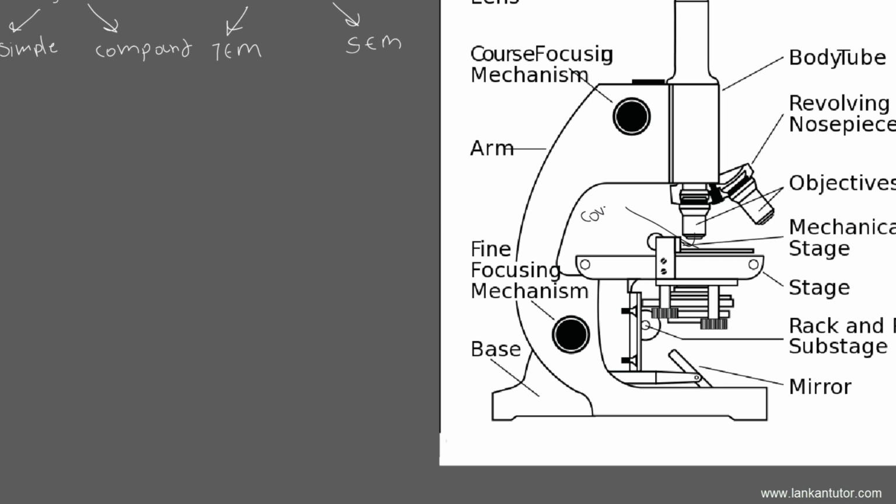The biggest knob is called the coarse adjustment, and it's what you use to get the main focusing. And then there's a little knob called the fine adjustment. The fine adjustment is to get the details and make sure you have the perfect resolution. And a bunch of clips, which are called the stage clips, and they are placed on top of the stage.